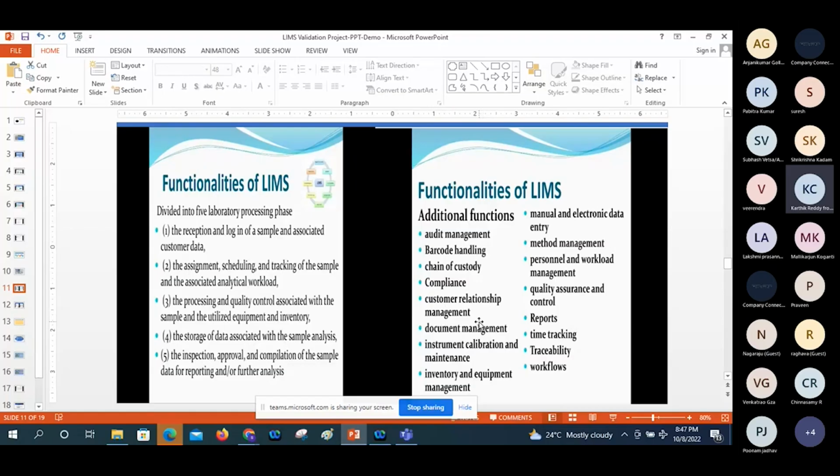Document management is one type of system we can integrate to the LIMS, like a DMS. SOPs, protocols, whatever is available, we can update into the document management, and it can be integrated to the LIMS. For example, while performing the analysis, the analyst should not need to verify any physical document. If document management has been implemented in the organization, we can integrate it to the LIMS application. The analyst has document management login credentials, can log into the system, and can get the specifications, whatever they require for reference while performing the analysis.